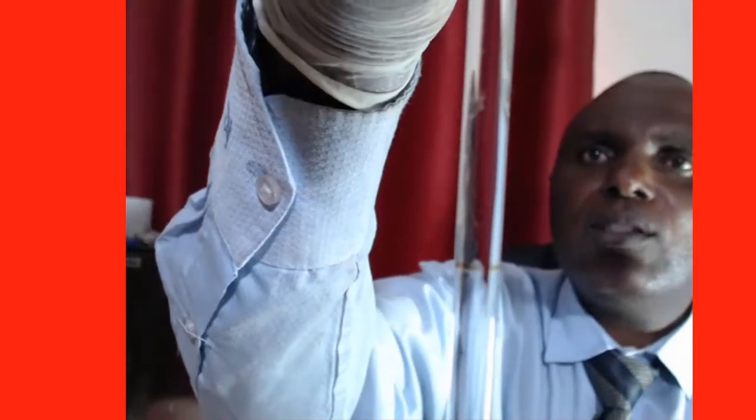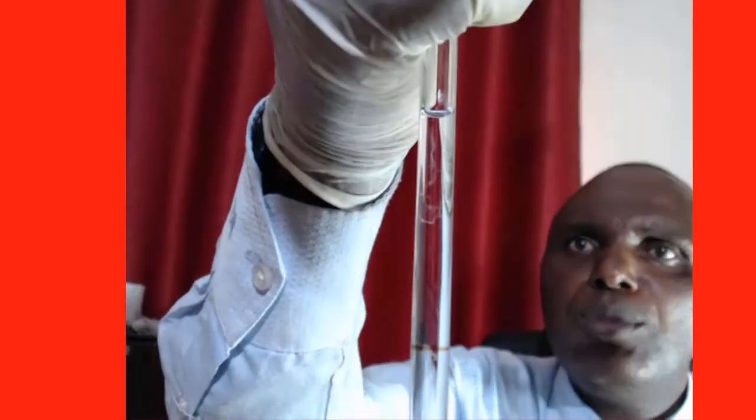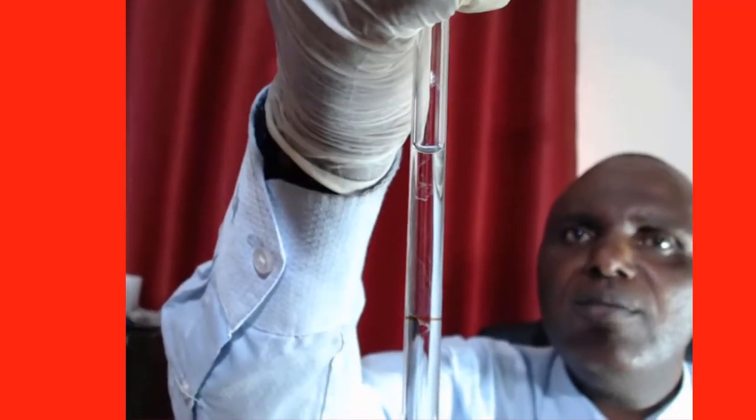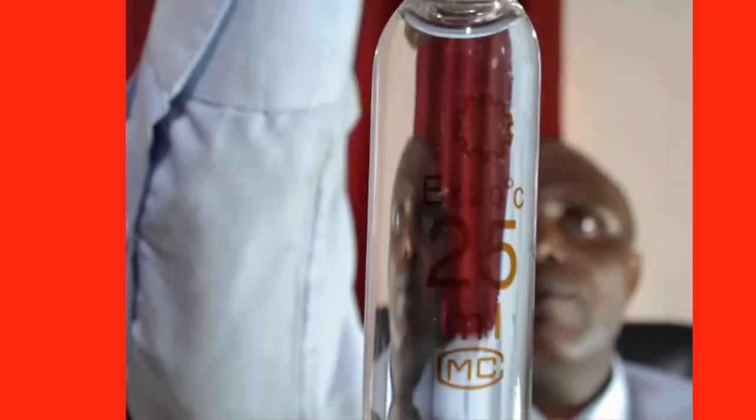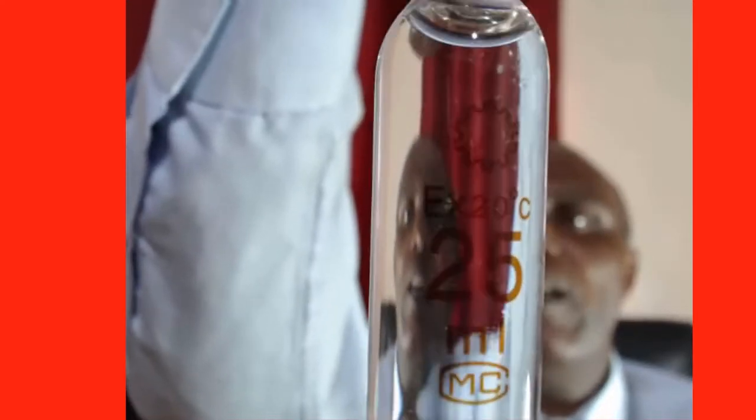Adjust the solution up to the 25 milliliter mark. Now I have my solution at the mark of 25 milliliters, and as you can see now, we are having 25 milliliters of sodium hydroxide.